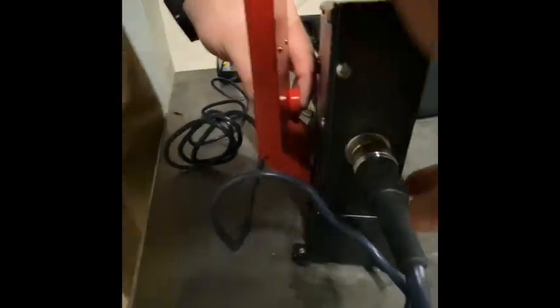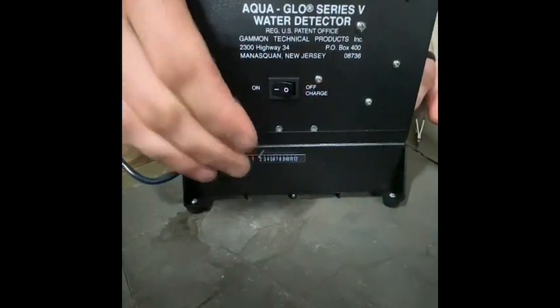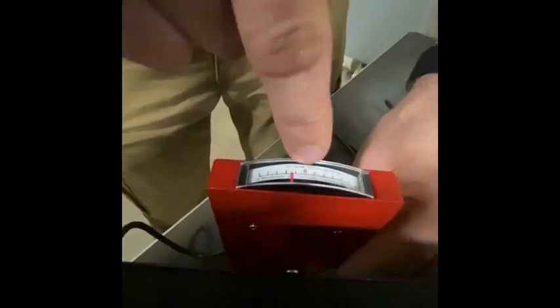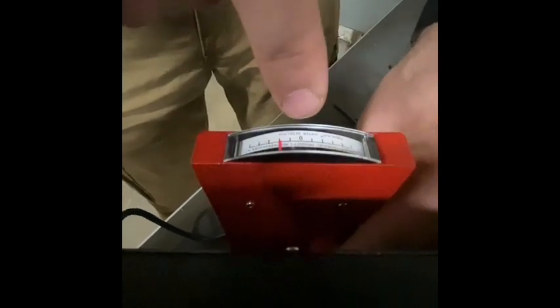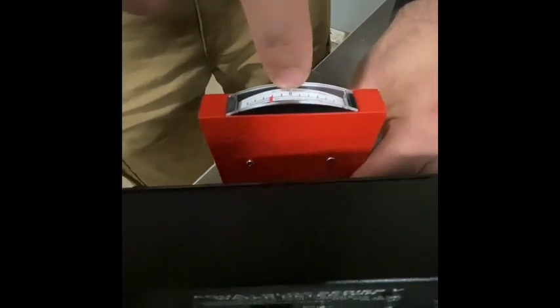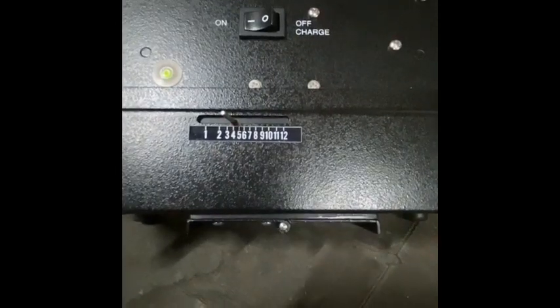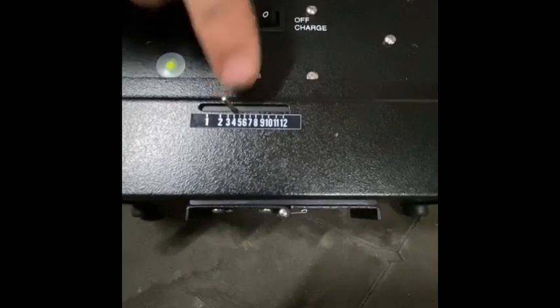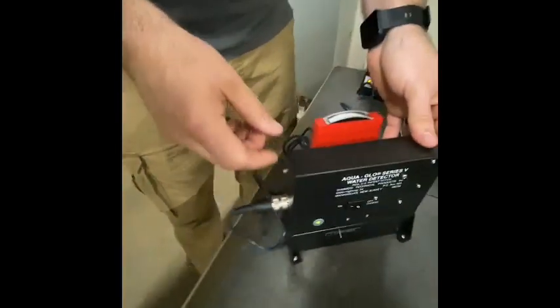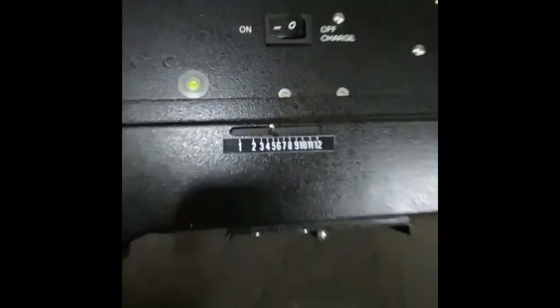And as you go, you start moving this dial. And you move it until the 0 on the dial here, obviously because there's no actual pad in there and fuel being tested, is off. But you would move it until this dial is at 0. And whatever number corresponds down here, say it's at 4 right now. This number is 4 parts per million. Now you notice, I said before with aviation units, 5 parts per million. So if you're right there, you cannot issue to an aviation unit.